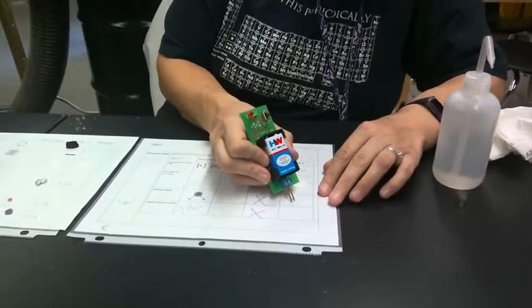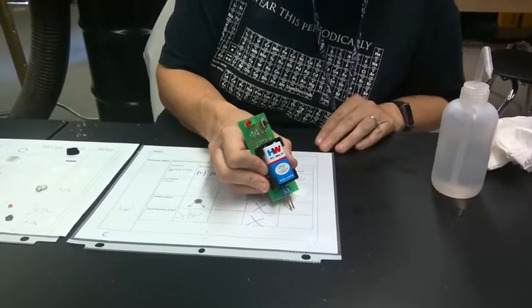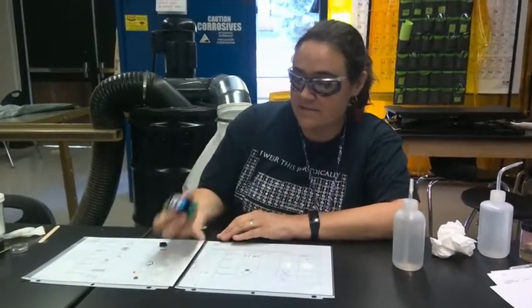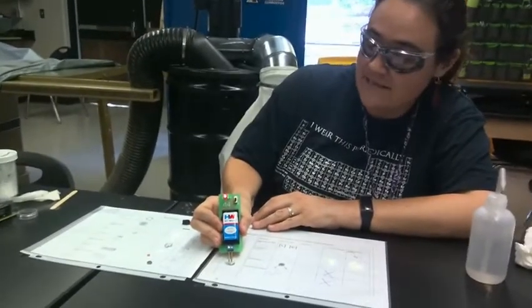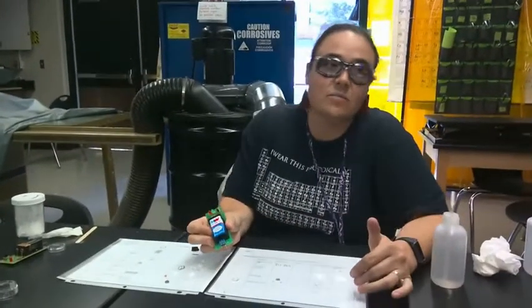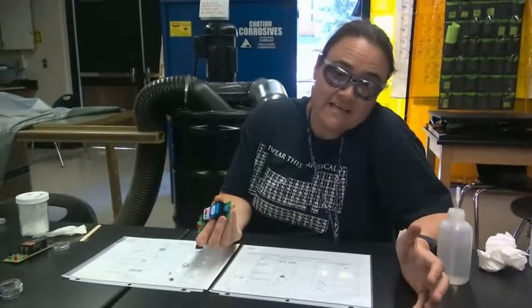Next, I have some distilled water, or also sometimes called deionized water. Think about whether tap water would have the same results. I have a little sample of tap water over here, and we can test the tap water and think about what is the difference between tap water and distilled water. And I think it's easier if we use the word deionized water.